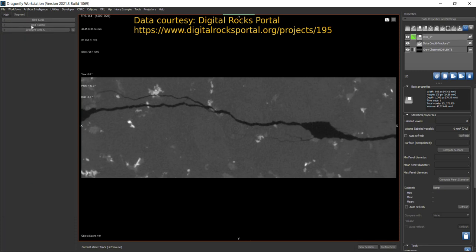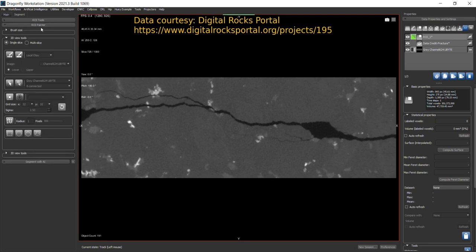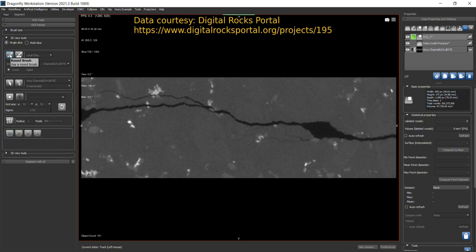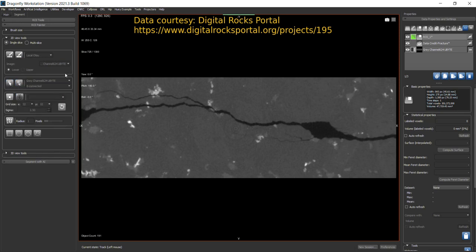Now let's come back to the ROI Painter. As you can see, you have different tools to add pixels to the region of interest. Single Slice is just for the current slice; Multi Slice paints through multiple slices throughout the volume. The tools available are: Round Brush, Square Brush, Point and Click Tool, Point and Outline Tool, and Smart Grid Snap Tool. You can hover the mouse over each tool to read a small note explaining what it does.